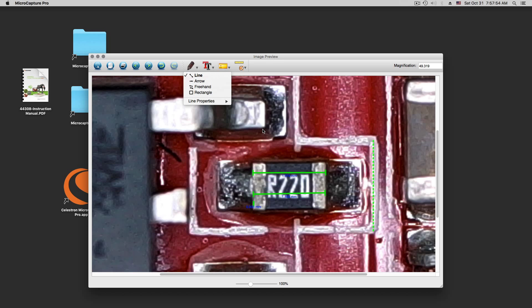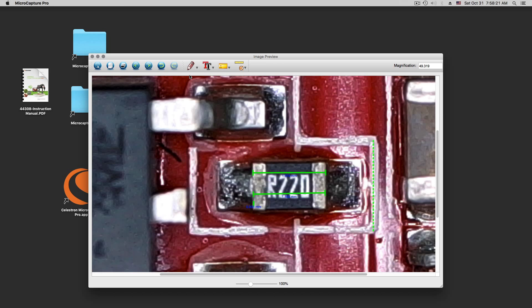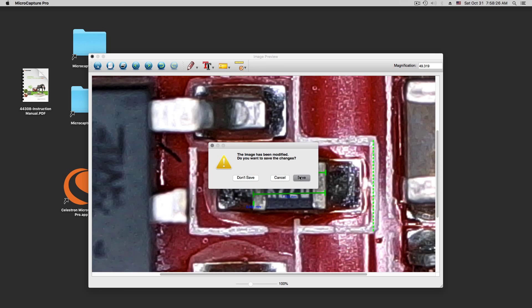So overall this program pretty much sucks. Way too slow, doesn't work much. If you look at my computer here, we have 10.11.1 on a dual 8-core, so this computer should be fast enough, just saying.